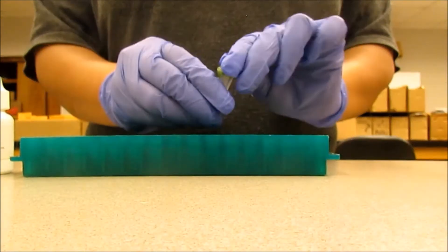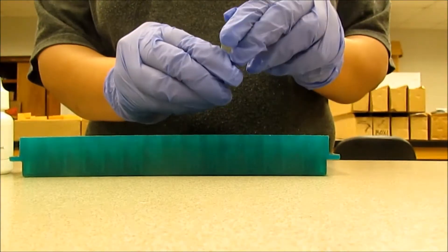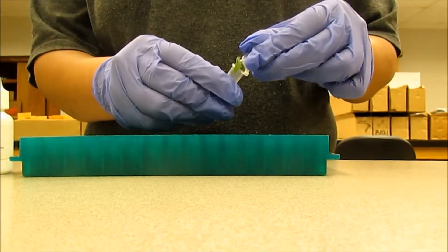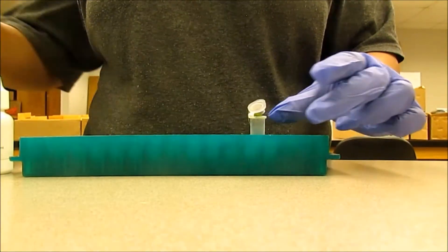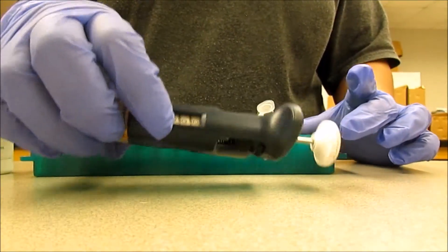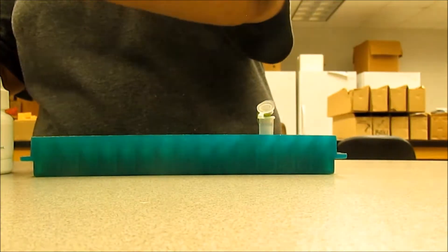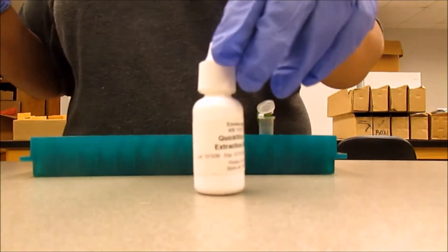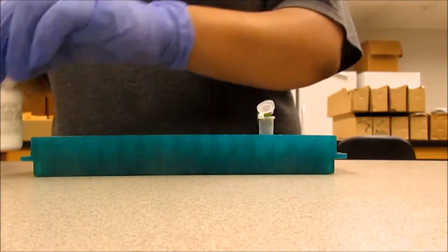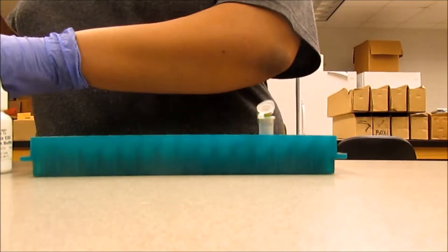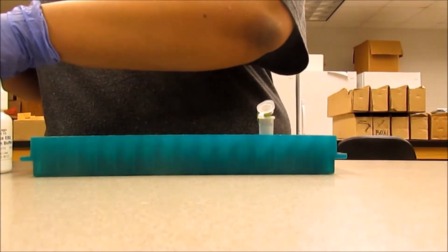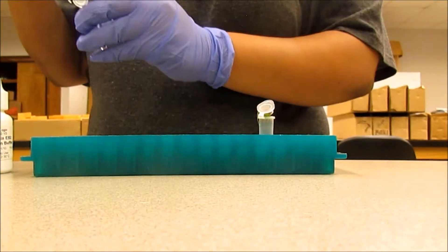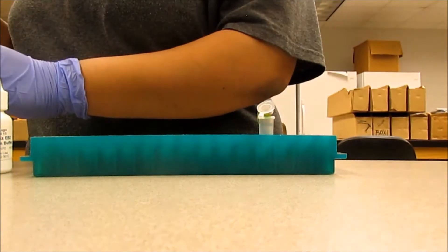So I have now collected the sample and we have to add the buffer to it. I have taken a 200 microliter pipette and I have to add 400 microliters of the extraction buffer to the sample. We are using the extraction buffer that is provided in the kit.